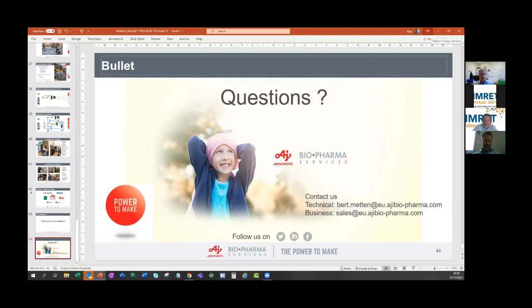Okay, another question on sonication that seems to be interesting, from Philip. Yeah, interesting for me also. Did the sonication damage the reactor installations themselves?